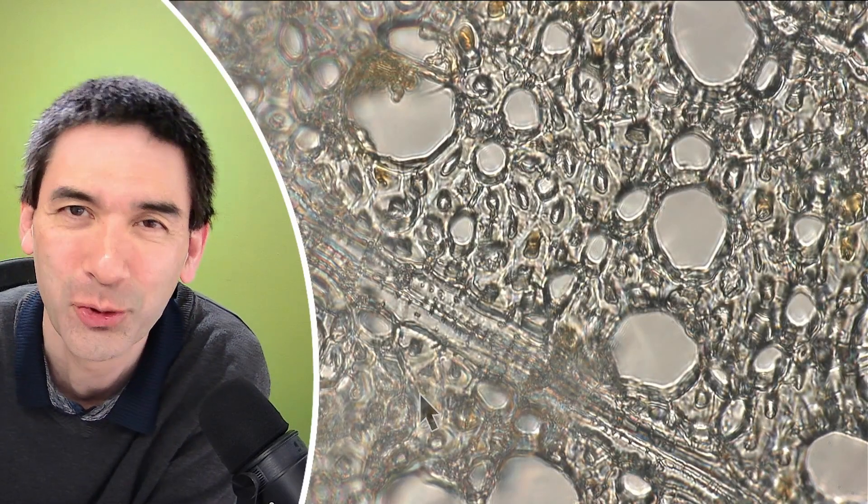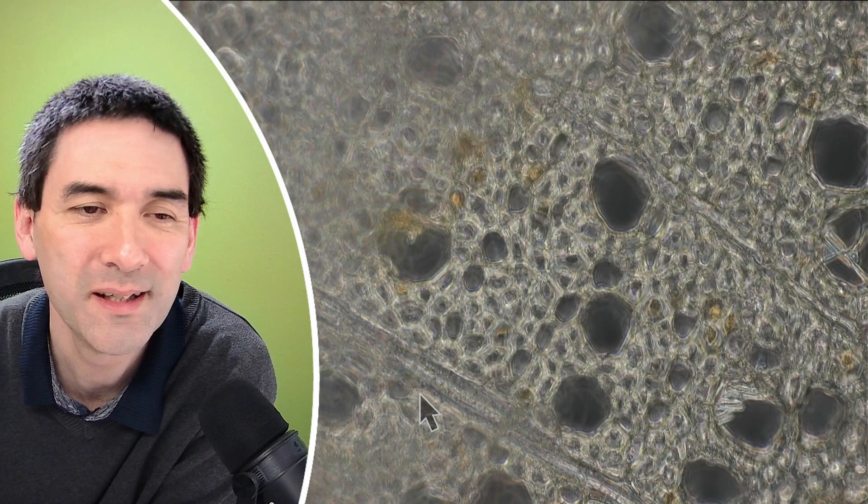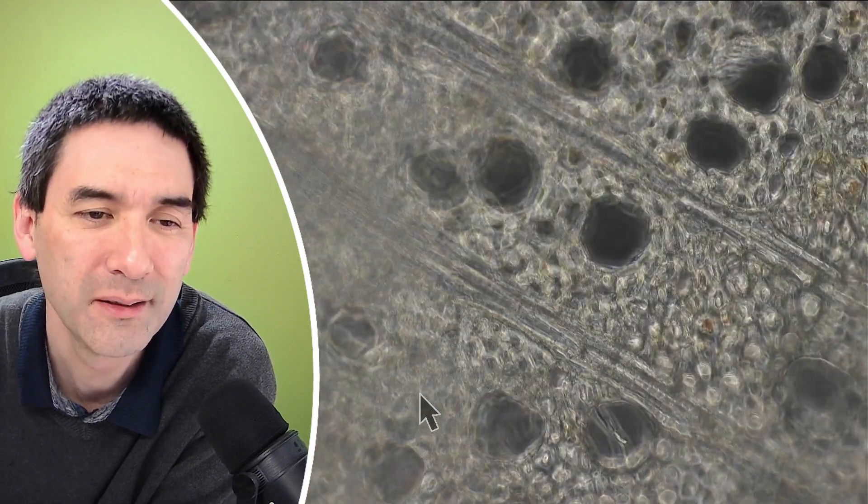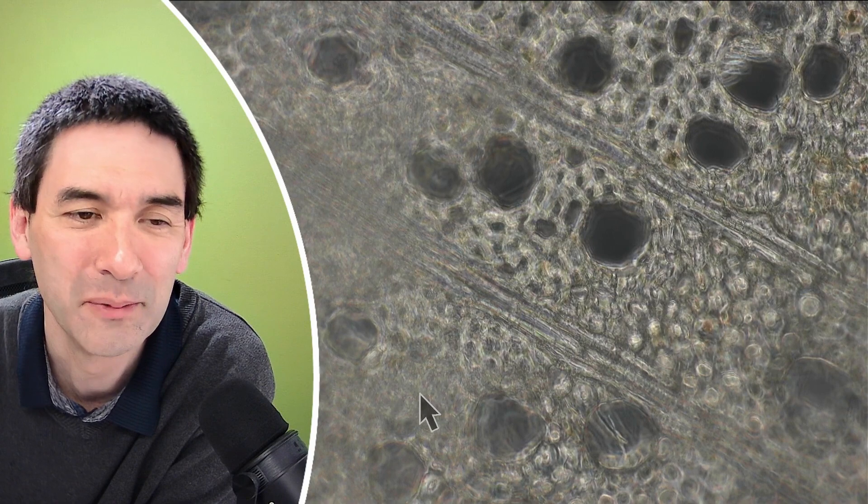Phase contrast, that's the last thing I'd like to show you today. Here this is in phase contrast. I think the other one was a little bit nicer to look at, but the patterns are quite pretty.